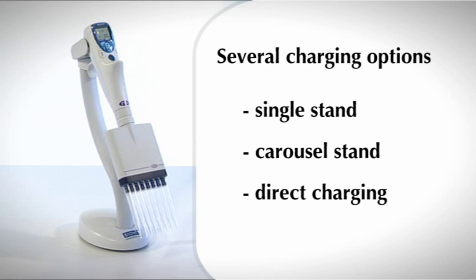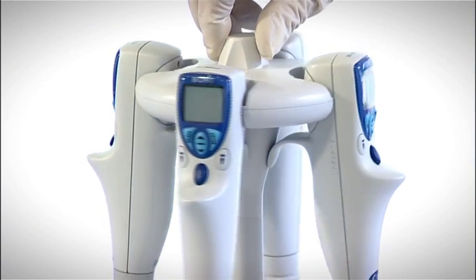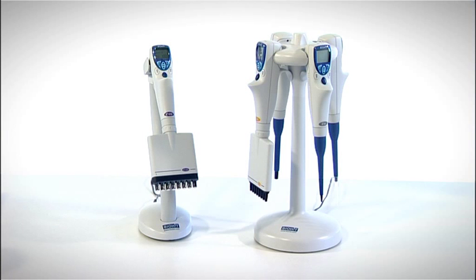When you are not pipetting, store your E-Line in the charging stand. This will keep it clean and ready for use at all times. The compact charging carousel is ideal for saving bench space. There are also single stands available.